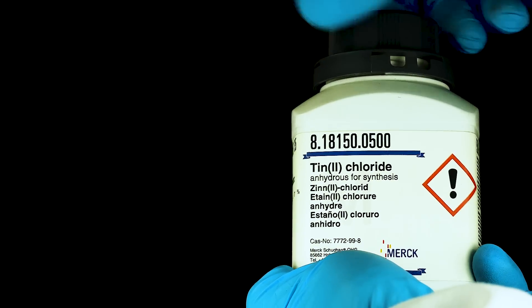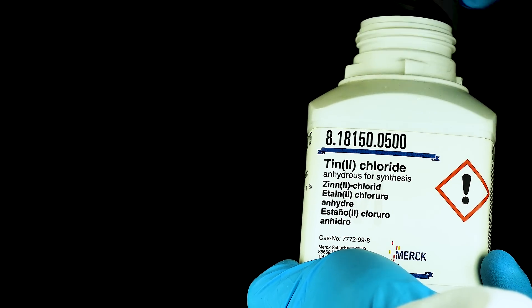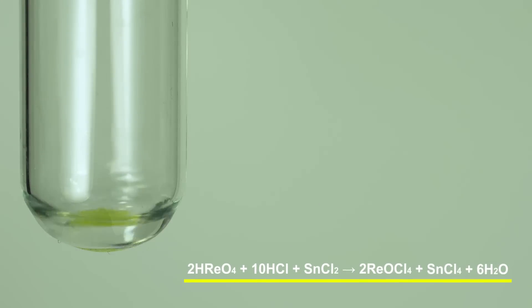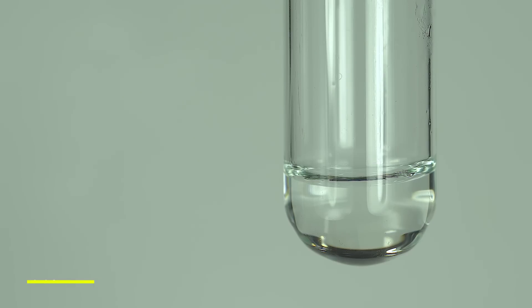The first suggested qualitative reaction for rhenium with perrhenate ions was the interaction of thiocyanate ions with tin 2 chloride and hydrochloric acid. Perrhenic acid solution containing any compounds of rhenium. As a result, the color changes from yellow to orange.